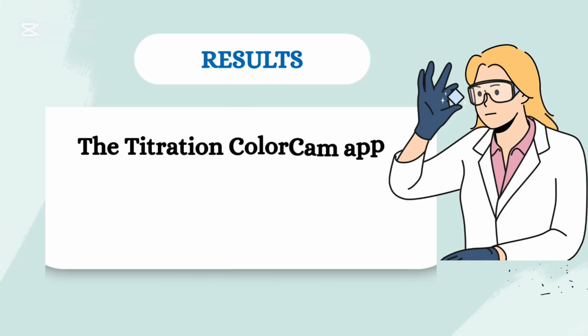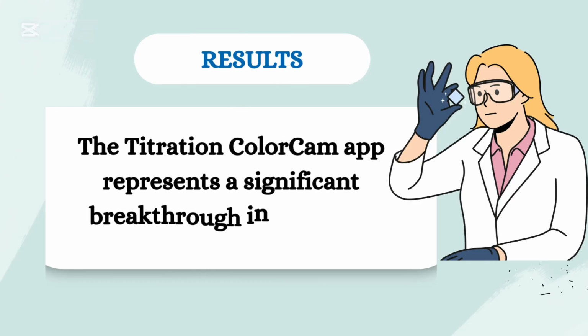The Titration ColorCam app represents a significant breakthrough in inclusive science. It allows students with visual impairments to perform practical laboratory activities such as titrations independently and with reliable results. This type of technology empowers students and allows them to experience the science actively, not just as observers, which is essential for truly equitable education.